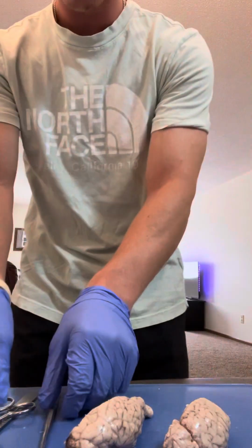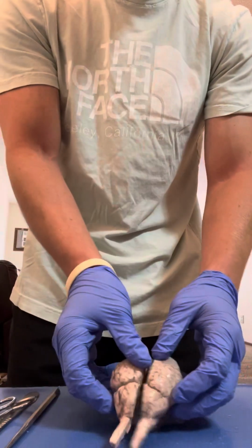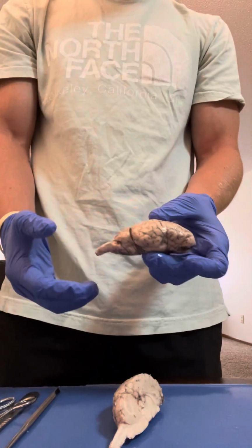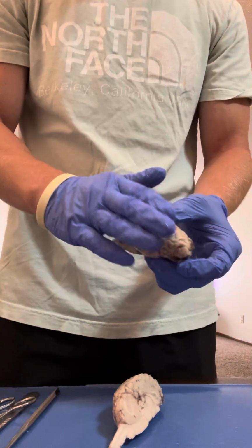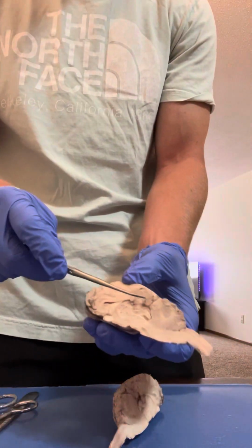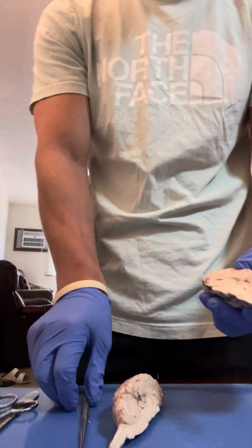Alright, so here we have a sheep brain cut into two halves. What would cover the brain would be the dura mater on the outside, and then the arachnoid mater, and then the pia mater right along the brain here. So the first structure we have to notice here is the cerebellum. This controls balance and muscle coordination.